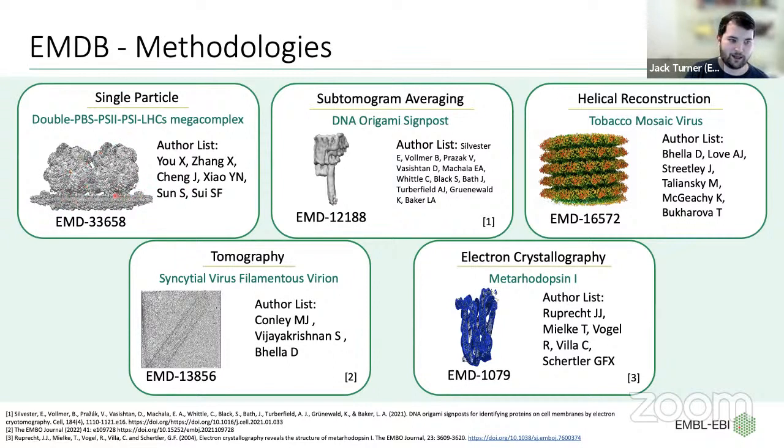So you can see the lipid bilayer along the bottom here. And then you've got these two gigantic things coming out of it. And there's a huge number of chains here. We're talking over 200 total PDB chains. The reason this one's interesting is it actually broke the EMDB data out pipeline. We did manage to fix it.